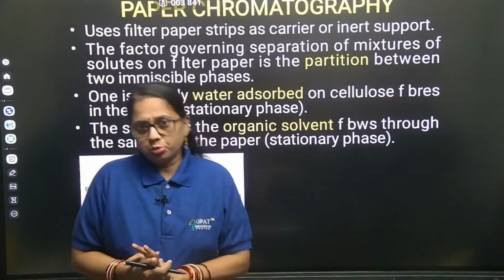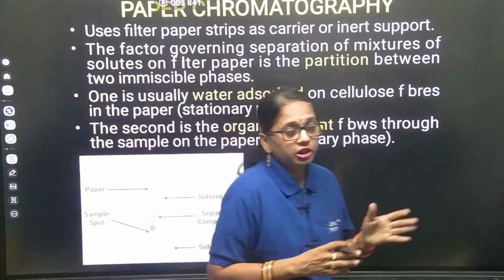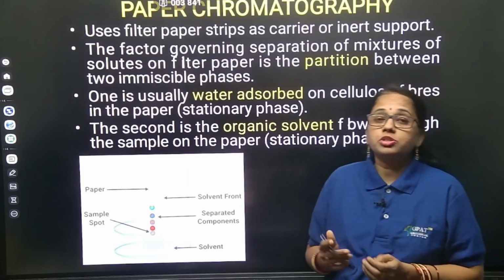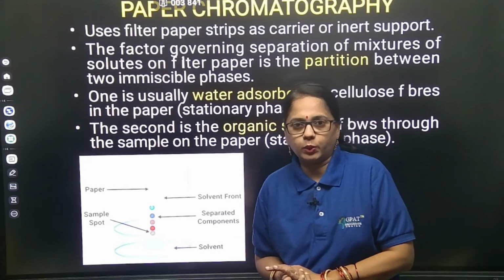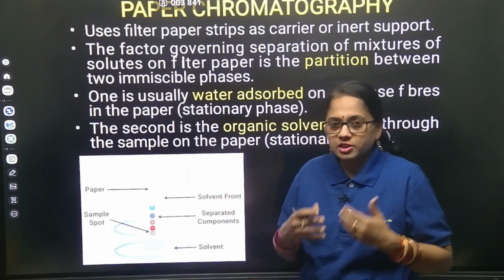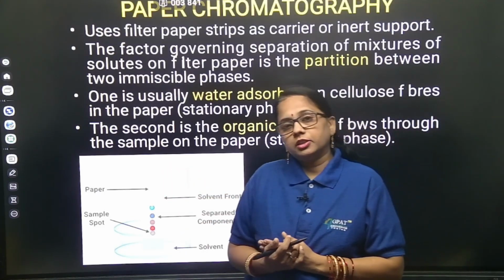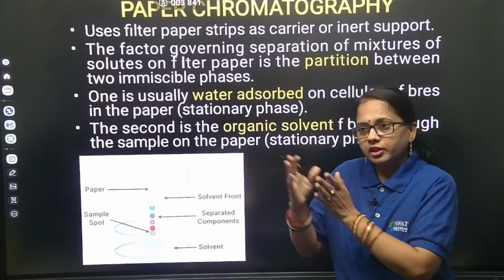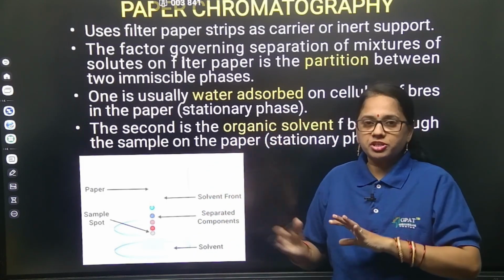And whatever papers we use are going to be one dimensional, and sometimes we also require two dimensional chromatography. Once the development has been done and we still expect that the compounds are not yet separated, then again the papers are going to be developed after the dimensions have been changed.